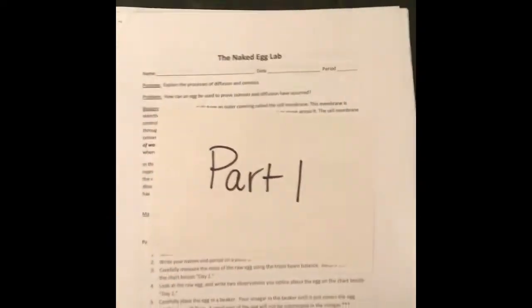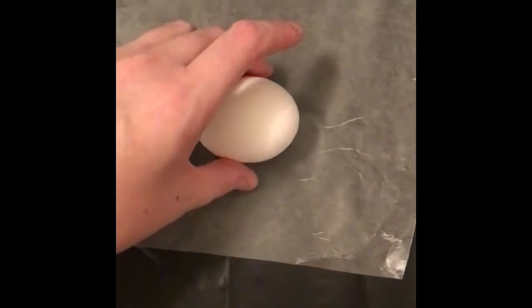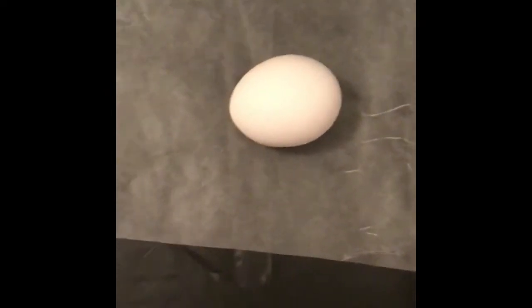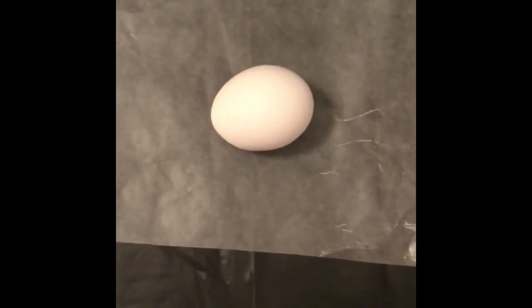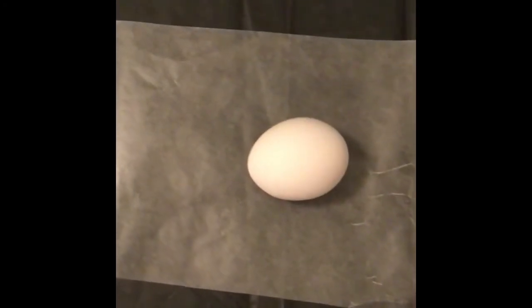We're going to be doing part one first. I'm going to pick up the egg. This is just a raw chicken egg. I'm going to set it here so you can make some initial observations. Again, it's a raw chicken egg.